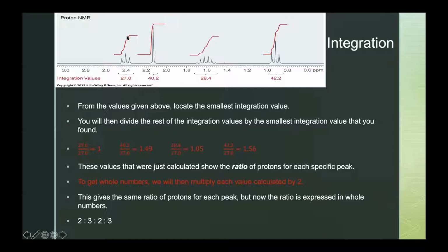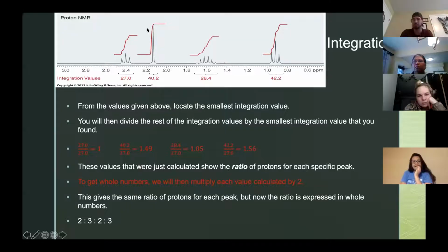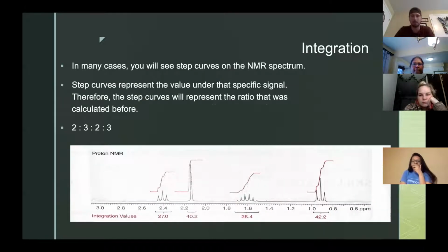And these step curves here are another representation of the ratio and the area underneath the peaks. Like I said before, the step curve is just a direct representation of the ratio and the area underneath each peak.